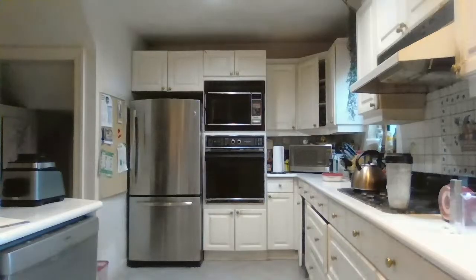So this has 40 grams of this Indian lentils, milled. Milled is always good for a measurement or a reaction. Sometimes stirring is good, but here I don't need stirring. So first, let me see a blank. All right, 100 ml of water in this beaker, and I'm going to measure. Oh, I didn't get the flashlight or torch. So flashlight, quick, flashlight.